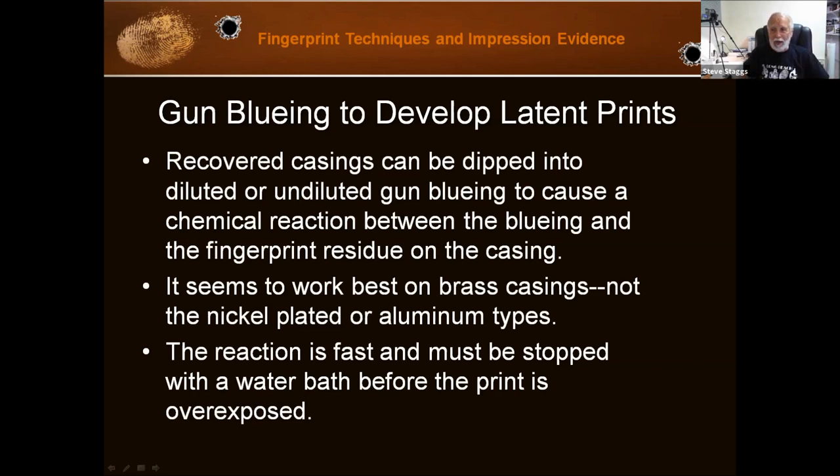This chemical reaction is quick, which is why we often dilute it — that slows the process down a little bit. And you have to stop the process by putting it in a water bath before it goes too far.